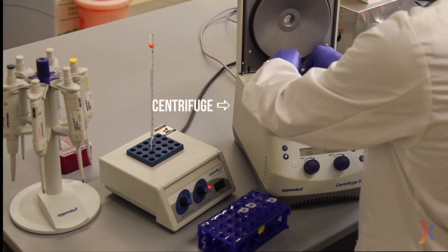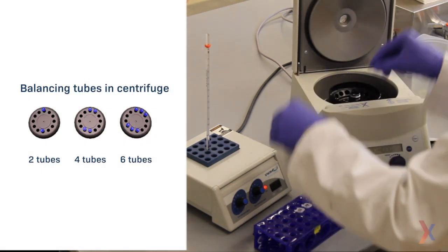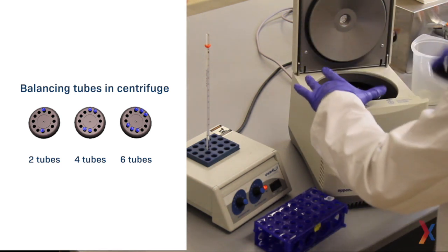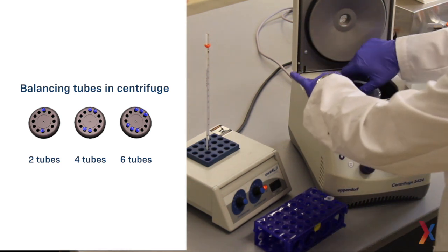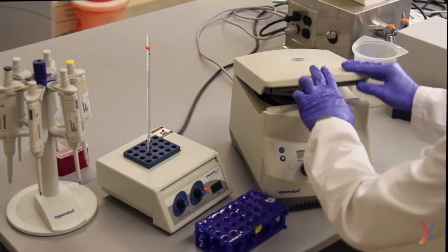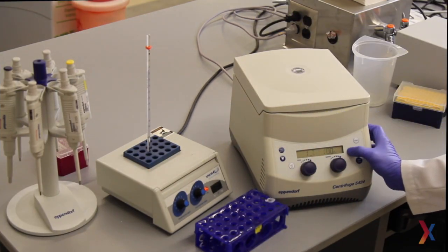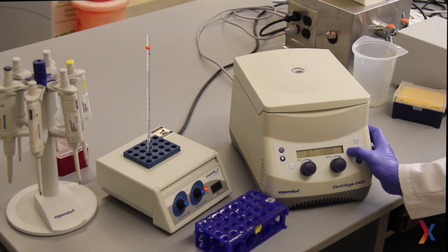I put the first two samples here and then I make sure to put the other two samples on the opposite side of the centrifuge so that it remains balanced. As always, add the lid and close, and for this purpose I'll just do a 10-second spin by holding the short button.